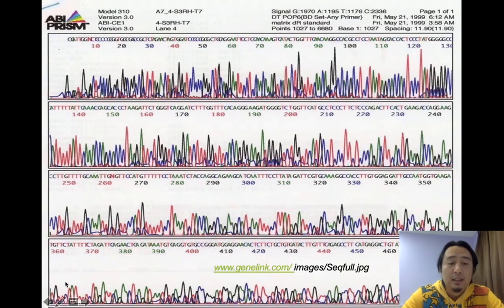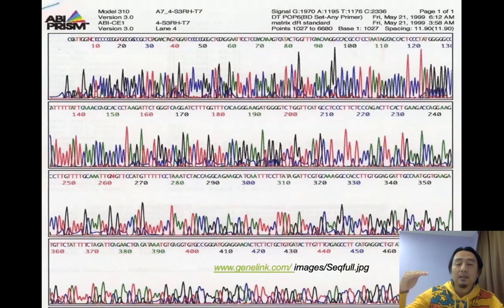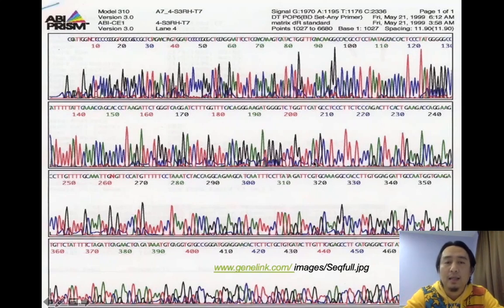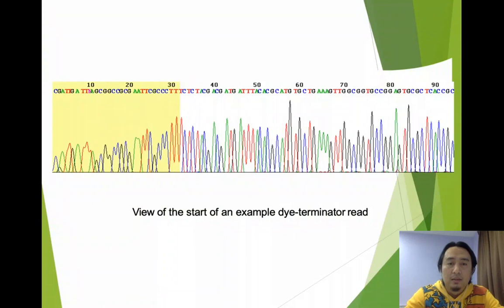Okay, usually the low graph appears during the earlier stage of elongation. So primer, for reverse primer, forward primer. So at this region, usually the graph is not nice because it is just starting. And also when it is about to end. So when it is about to end the graph will not be nice either. Okay. So in the middle, the graph should look like this. So it must be nice, to ensure the correct position of your nucleotide sequence. Right. So that was an example.